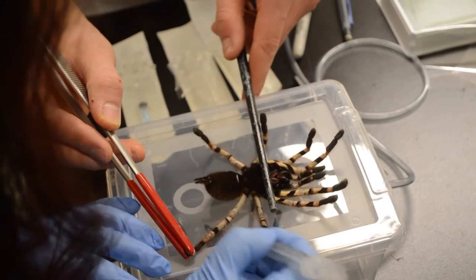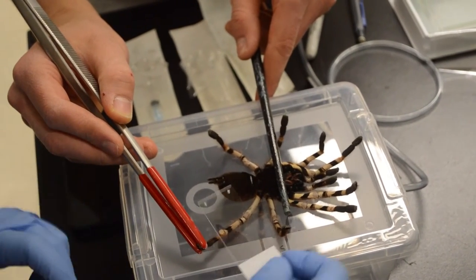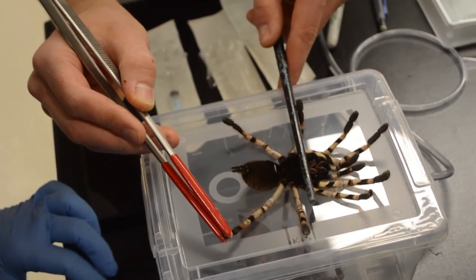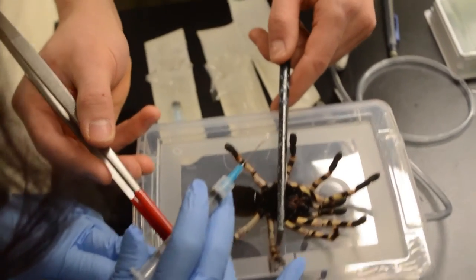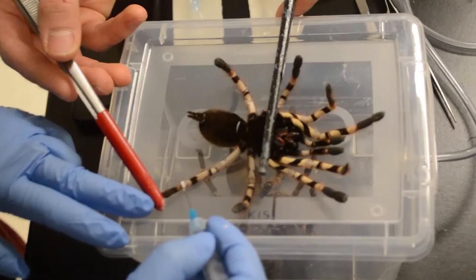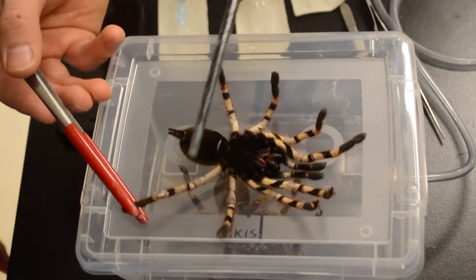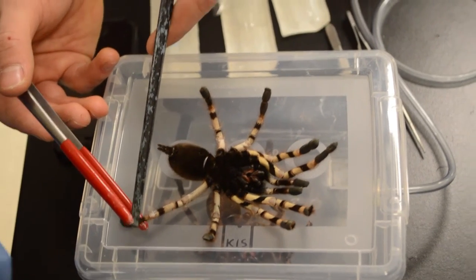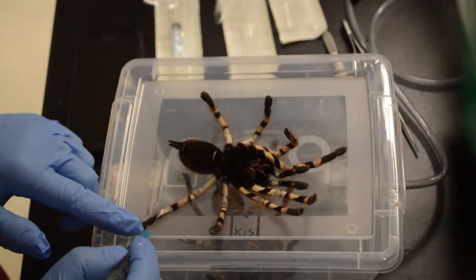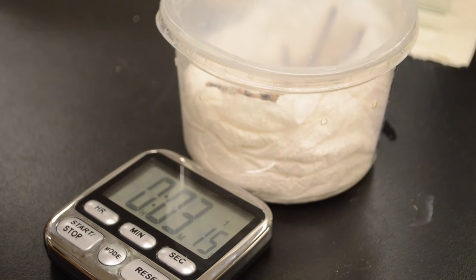The incision is on the underside, or the ventral side, of the leg joints. We make a tiny incision, touch a slide to the hemolymph — that little bead of hemolymph that bubbles up — and then we close the incision afterwards using a little bit of superglue, which was originally intended as an emergency bonding agent for human skin wounds, but works equally well for closing tarantula exoskeleton wounds. Then we wait for them to wake up afterwards.